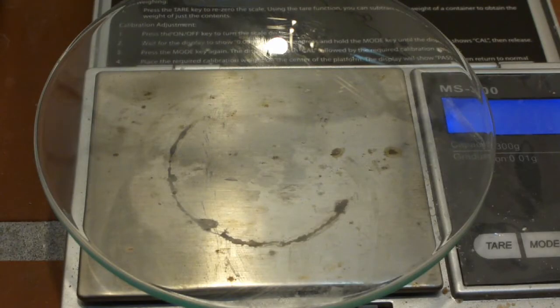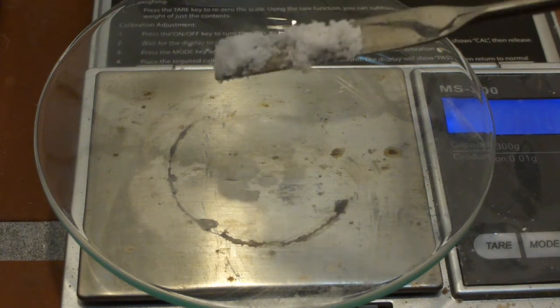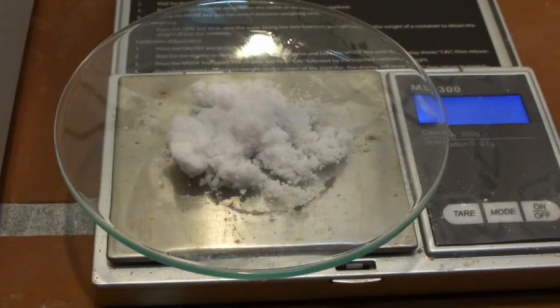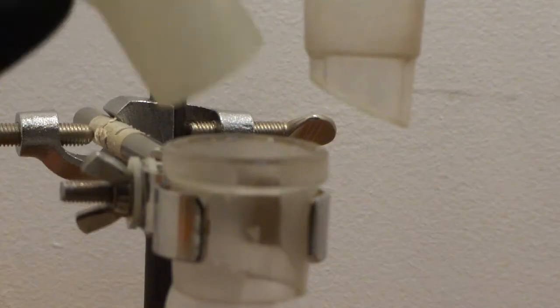While this was mixing, we measured out 3 grams of p-toluene sulfonic acid monohydrate. This was then added to the round bottom flask containing the aqueous sulfuric acid.